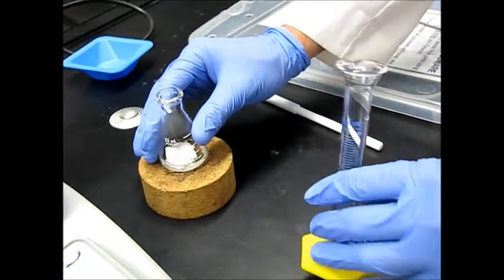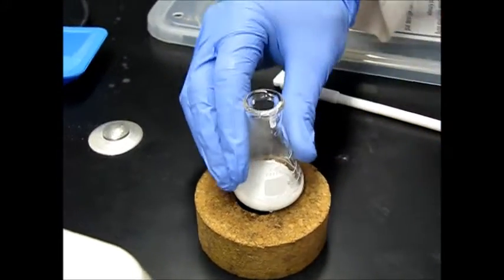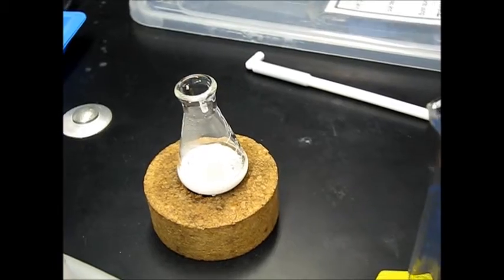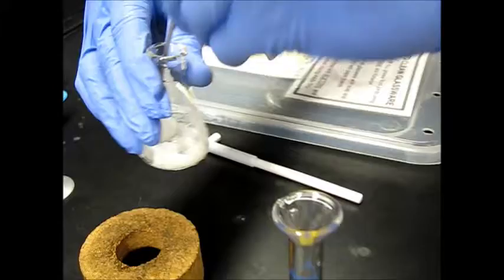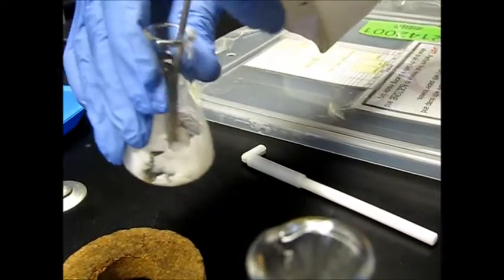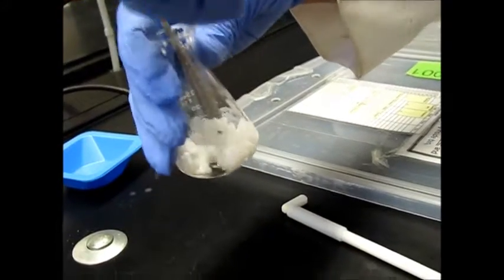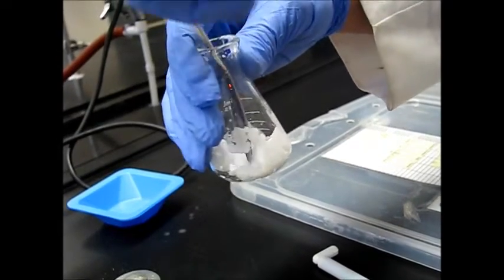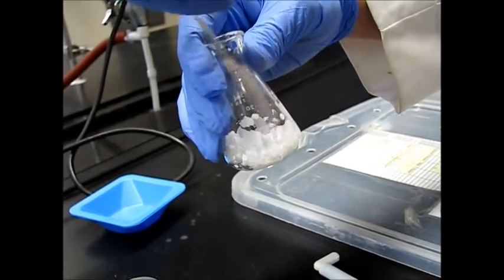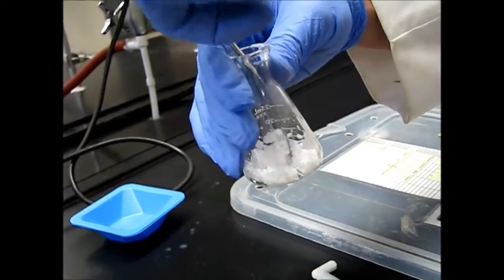So first we're just going to get a little bit more water just to finish out that precipitation. Cool. And in the manual it does say to stir with the micro spatula just to help that precipitation occur, get the water everywhere. So now this next step is we're going to be eliminating any borohydride that's trapped in this solid. So we'll go ahead and do this right now.